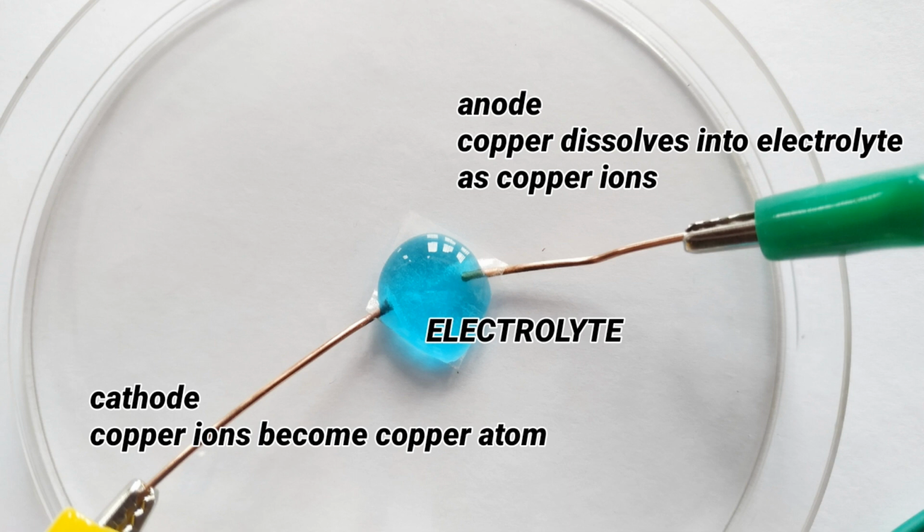Before we do this experiment, we need to understand what happens when the electrolyte undergoes electrolysis. As soon as the two copper electrodes, cathode and anode, are dipped together into the electrolyte, two reactions happen at the electrodes. What happens at the cathode?